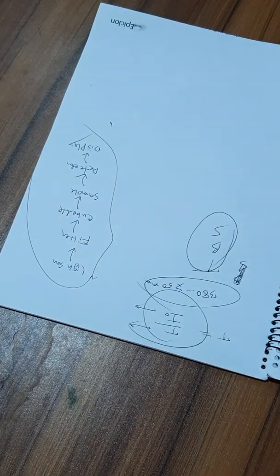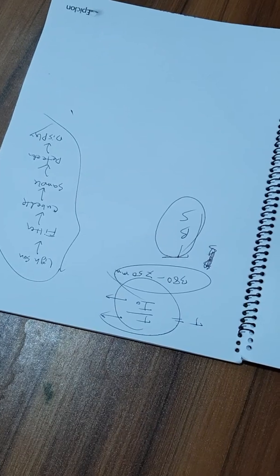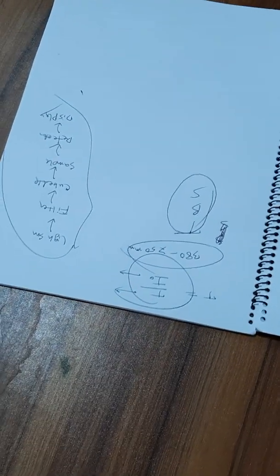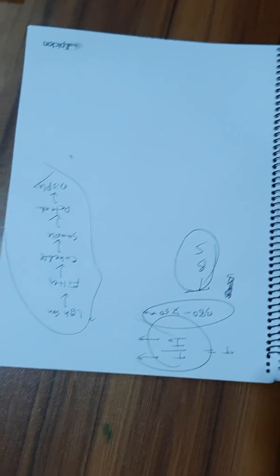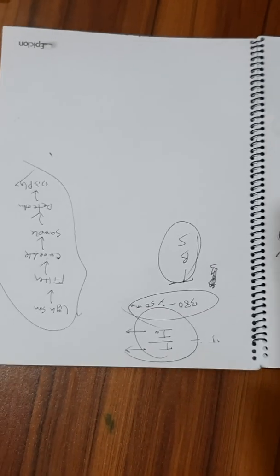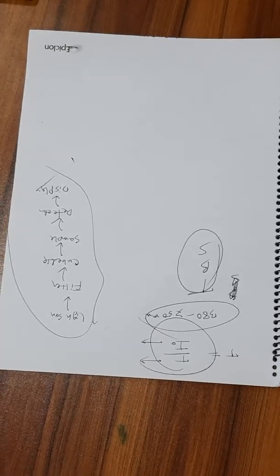The principle of the colorimetric reaction is that when a specific or known wavelength light passes through a sample solution, the intensity of the color is proportional to the concentration of the substance in that solution, and we measure it colorimetrically, which is one type of photometry, at a specific wavelength.